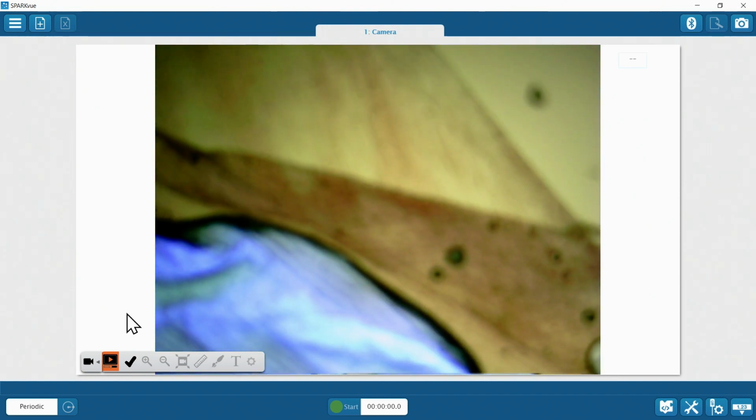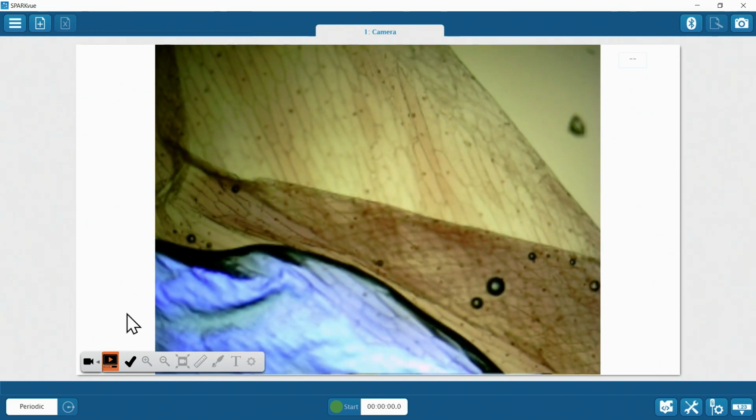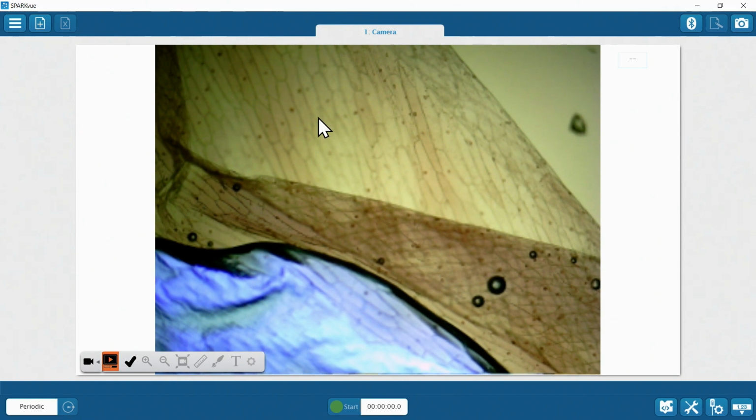Okay, wow, we're looking at a whole lot of colors here. Let me focus. Aha. This is very interesting. So on this area over here, this is just light coming through an air bubble. So we're going to ignore the blue part. This is some onion skin that's folded over on itself. So it's not good to look here because I got more than one layer. I'm trying to find a single layer here. This looks like a good area to explore. Let me move over in there.